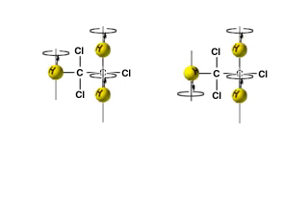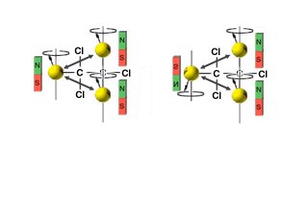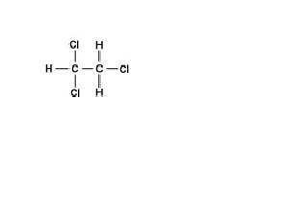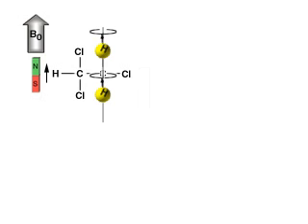The cause of spin-spin coupling lies in the magnetic nature of the spinning hydrogens. Like little bar magnets, hydrogens on adjacent carbon atoms can sense the orientation of one another. Let's consider the case of 1,1,2-trichloroethane. If the spin of the methine proton is aligned with the magnetic field, B0, then its magnetic moment adds to the magnetic field experienced by the methylene protons, which slightly increases their resonance frequency.